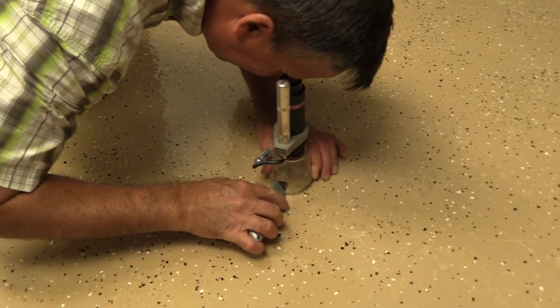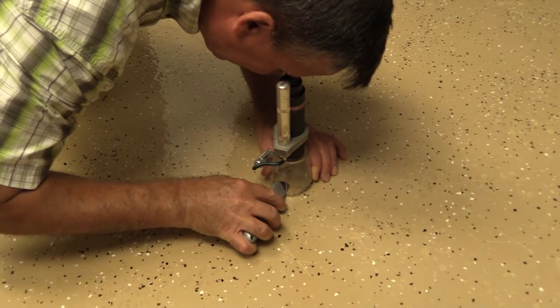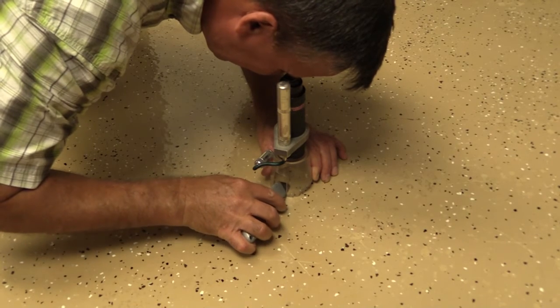A low-power microscope with 20-50x magnification helps the investigator to identify flaws or deficiencies that would otherwise go undetected. Microscopic analysis also helps focus the direction of the investigation and identify the types of samples that should be collected for laboratory analysis.